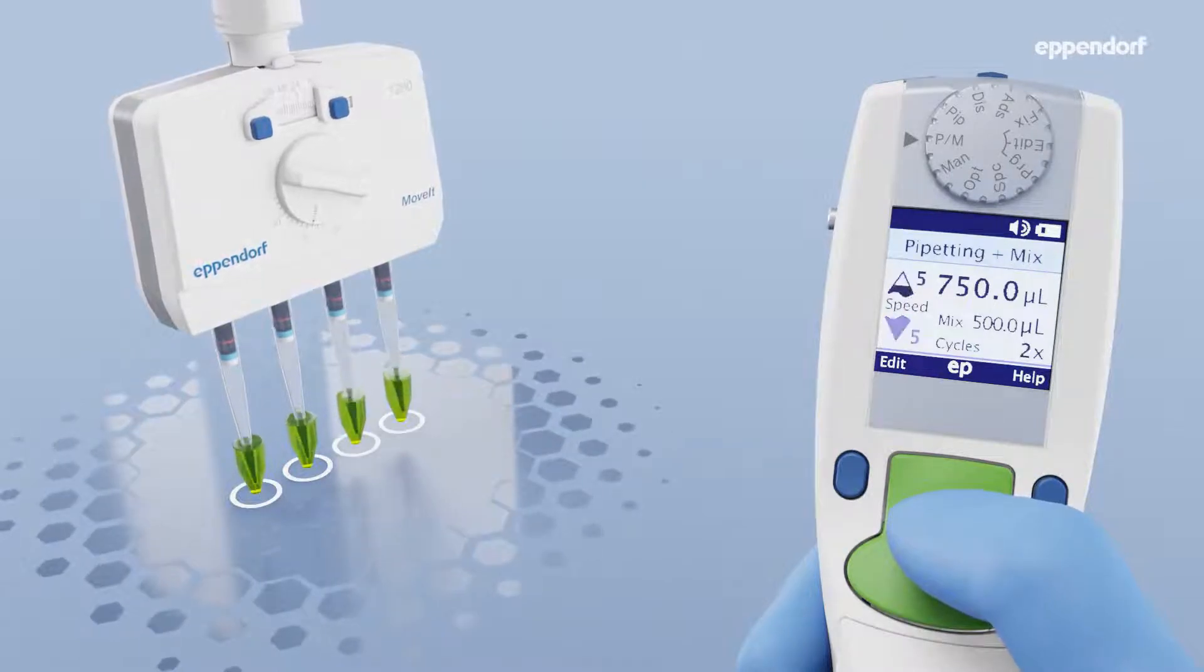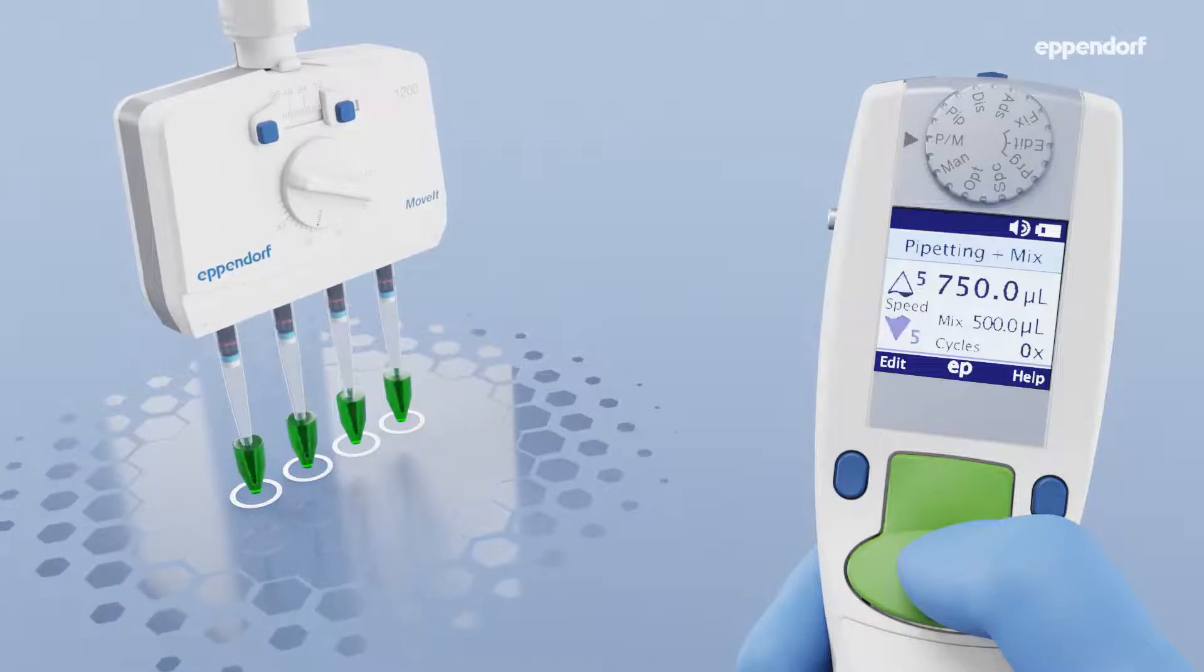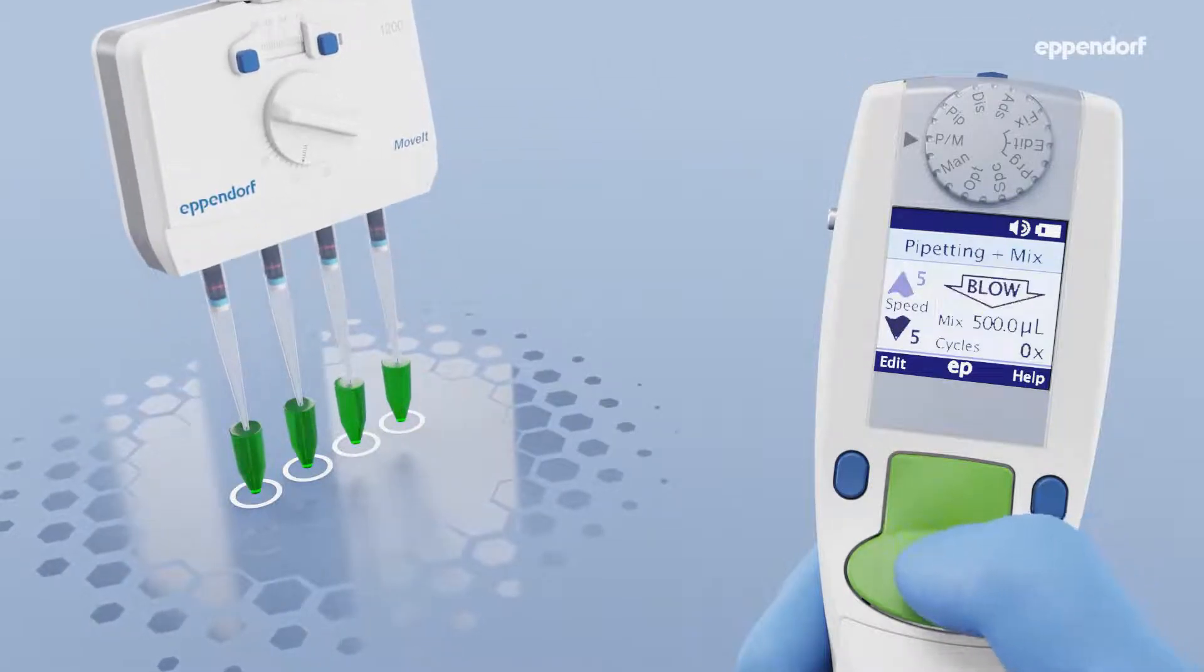Holding the rocker down during mixing will continue the process beyond the number of set mixing cycles. Pressing the rocker down again after the mixing process will perform a blowout.